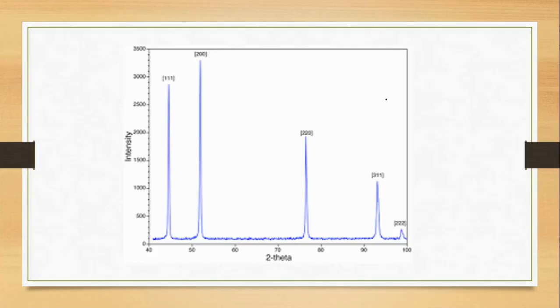Next question I'm getting is, do you prefer solid or powder diffraction? It depends on the material that I have. Okay. So you can interpret properties of the crystal from this plot. Yes, you can.